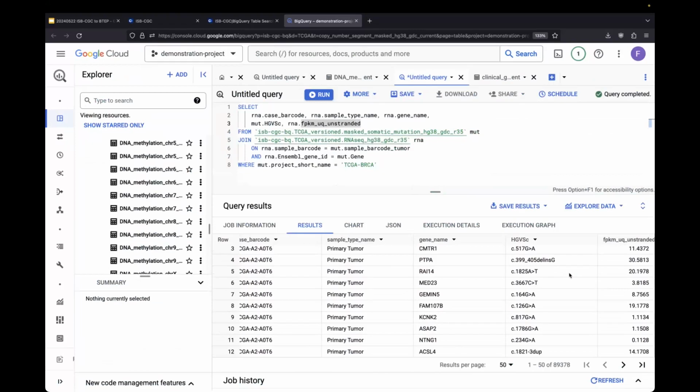I don't have a lot of time to go into detail, but we have a whole bunch of notebooks that demonstrate how to do these types of analyses. I'm going to show them to you in a bit, but I also want to spend a little bit more time jumping around the console to give you a little bit of familiarity with what's going on in here, so that if you do want to try this out yourself, you're not floundering and completely lost.